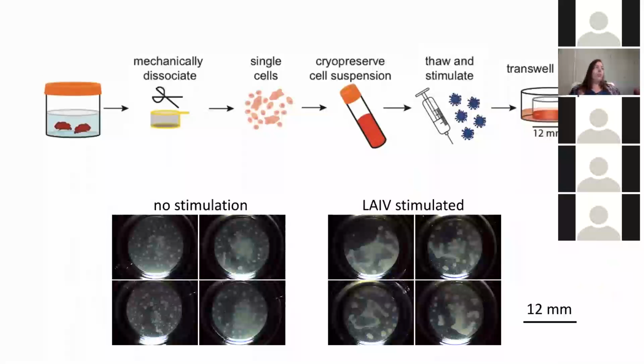So this is overall what the organoid workflow looks like. We collect tonsil tissues from Stanford's Children's Hospital. At Stanford, at least, most of these surgeries are happening for obstructive sleep apnea in both adults and kids. So overall, the tissues that we collect here are quite healthy.